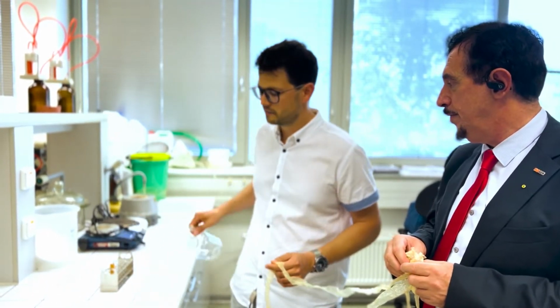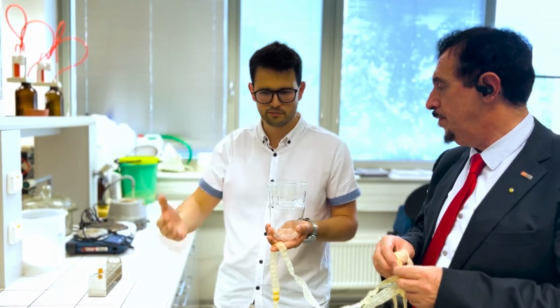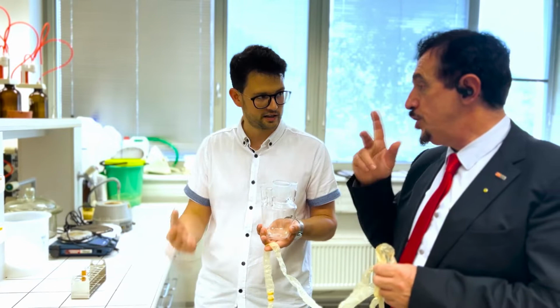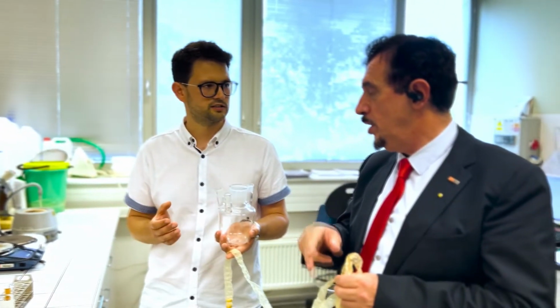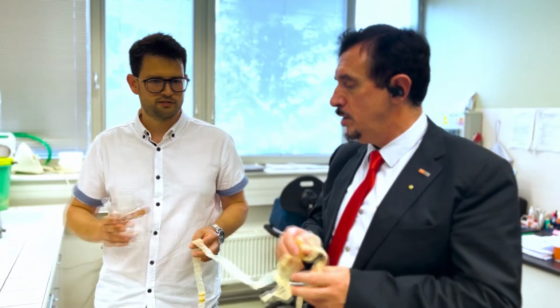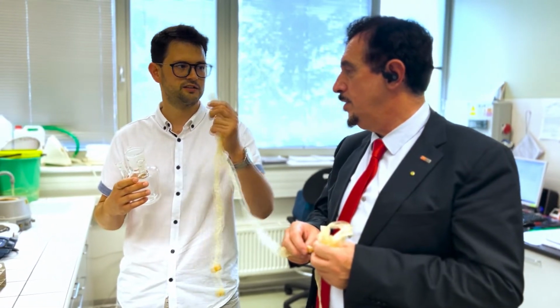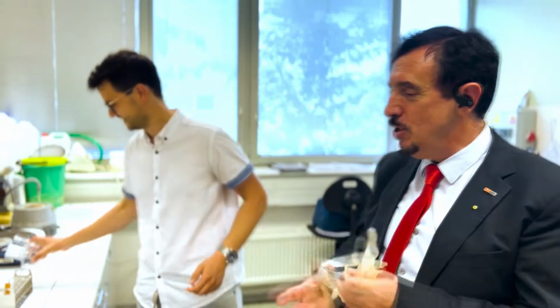Here at this lab, we usually go from small scale. We have to perform many experiments to study the reactions and the processes and to optimize the process of shortening the molecules. Basically, yes. Or if I put it very simply, it's how to cook this with no waste at the lowest price possible. That was my other question. So there is no waste here. Yes.